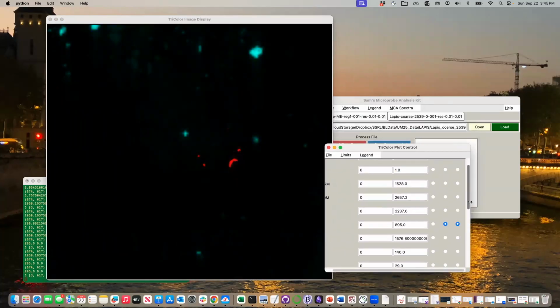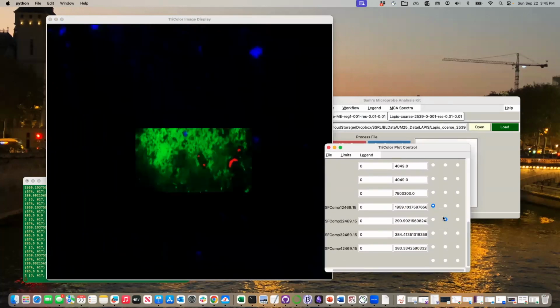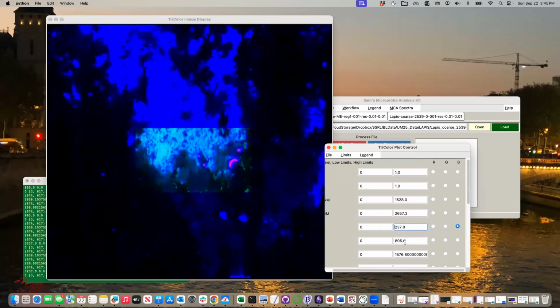And let's go back to green here. All right, or we could even say the full sulfur context. That should be this one. I see all the other pyrites in there. We would have to really scale this down to see all the other features. There you go, for instance. This is another really good example of maybe we want to look at this in a different way rather than just RGB data sets.